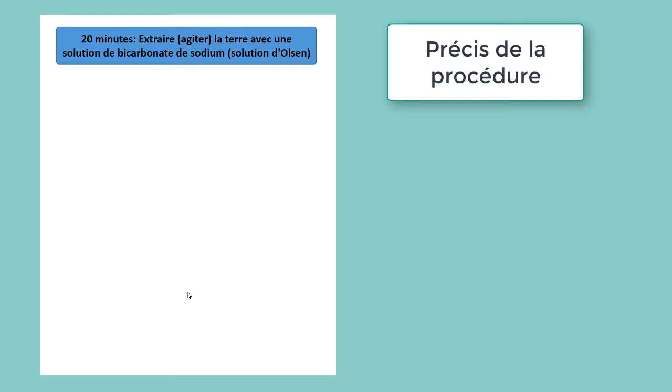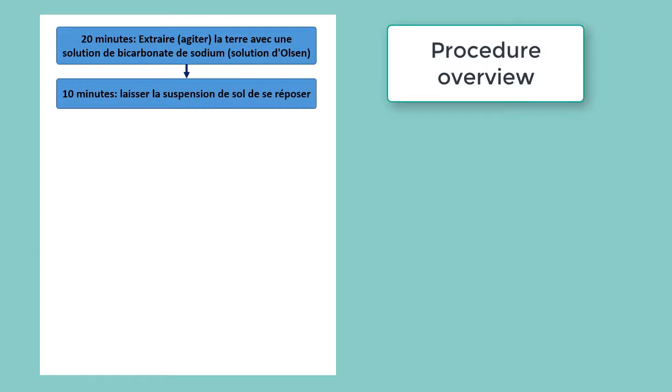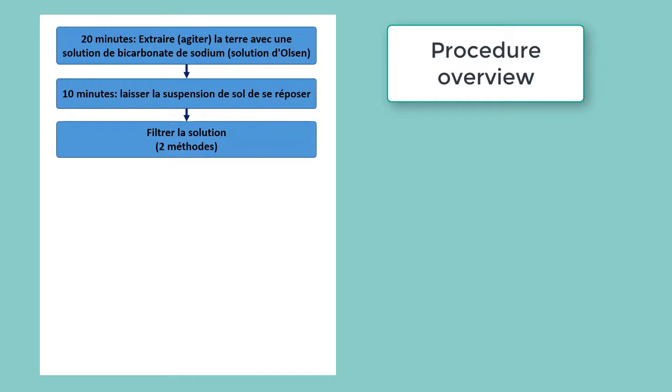Here's an overview of the method that we're going to use to analyze available soil phosphorus. First, we extract or shake the soil in the sodium bicarbonate solution, which is also called Olsen solution. Then, we're going to allow that solution to settle for 10 minutes so that some of the clays settle out to prepare it for filtration. Then we filter the solution.